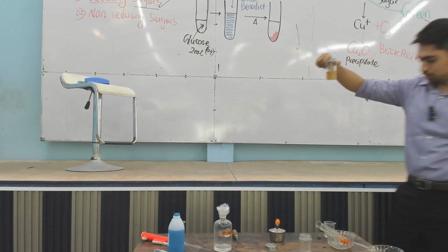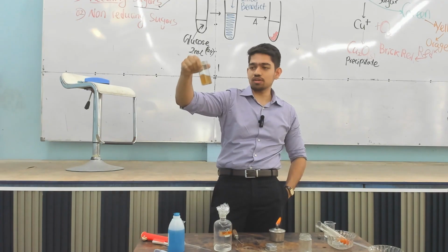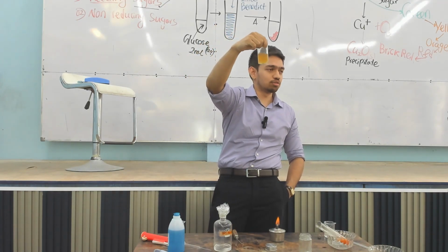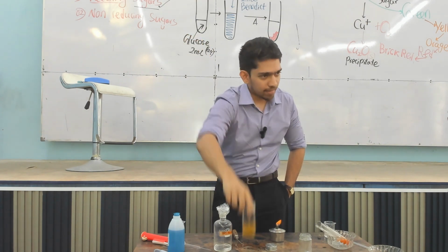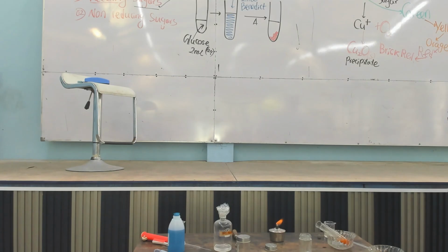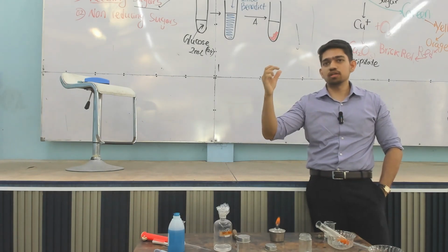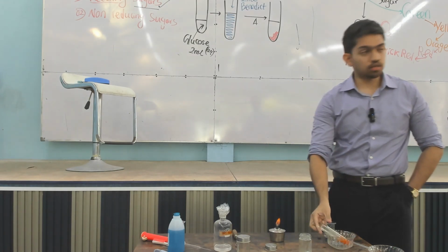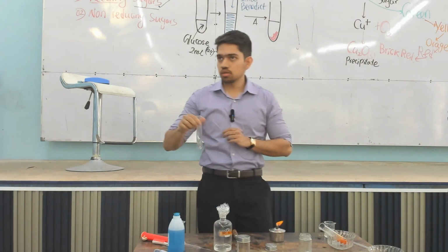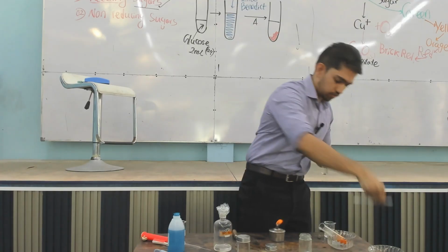But how about if it was fake honey, made with sugar? If it had sucrose, is it going to be reducing sugar positive? No. So we can try just for fun. Then I think I have some fat-free milk also, because it's going to mainly have lactose. If you remove the fat, it's going to be mainly proteins and lactose. Lactose is a reducing sugar, right? So lactose should be positive for Benedict's test. Okay, if we have time, let's see if we can.